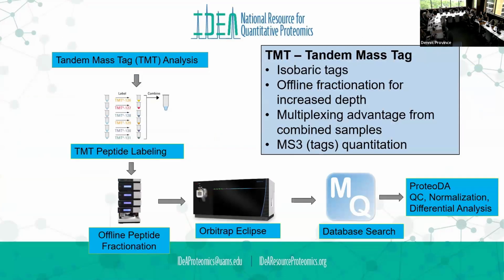For the TMT experiment, it's still a DDA experiment. We just label your samples on the front end with tags, and TMT is a Thermo product. There are other, was it iTRAQ or whatever? There are other people that do labeling, but Thermo's pretty much taken over the labeling experiment. And they have a 10-plex, they'll have a 16-plex, they even have a 32-plex now, which is really double 16, sort of.